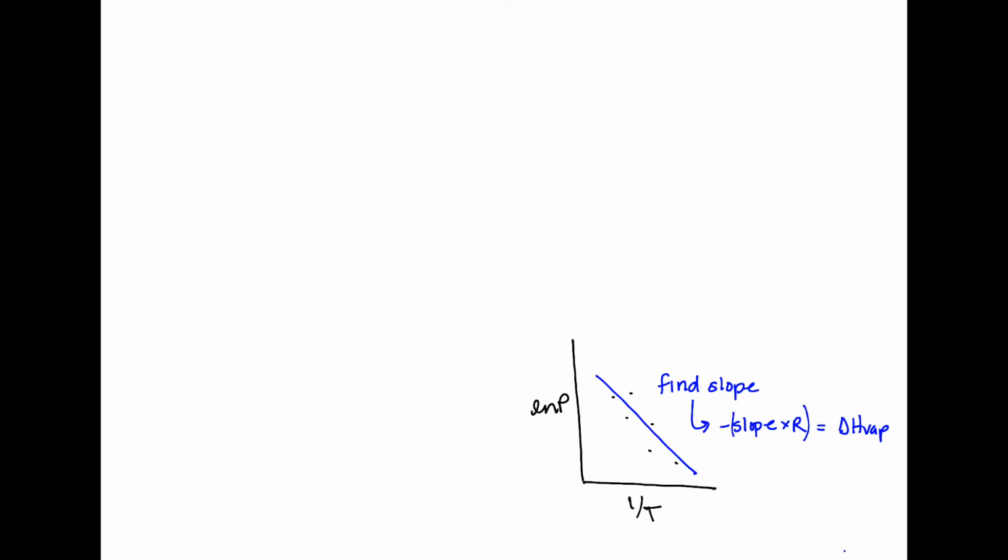Now that wouldn't be very hard if we could just find the partial pressure of water. So this is just the pressure of water, and it's actually water vapor. But that's a little bit complicated. We've talked about how when you want to trap a gas, you usually trap it by bubbling it up through water or putting it in an inverted container in water so you can see where your gas starts and where the water around it begins. And so that's one of the complications for finding the partial pressure of water for this lab.